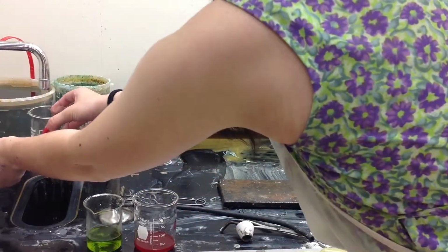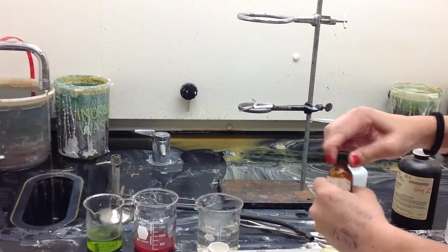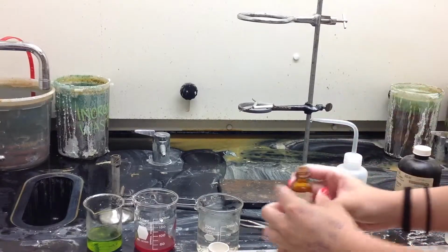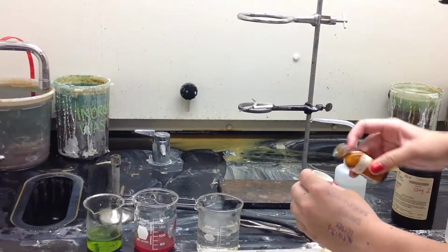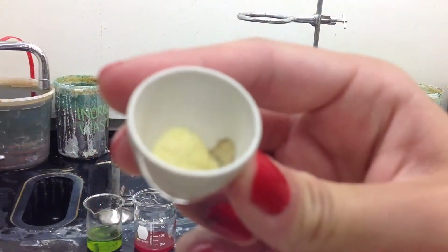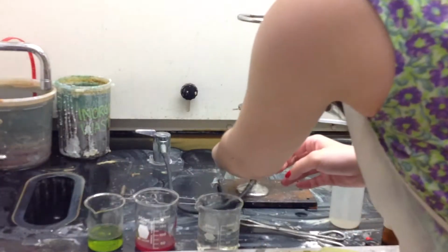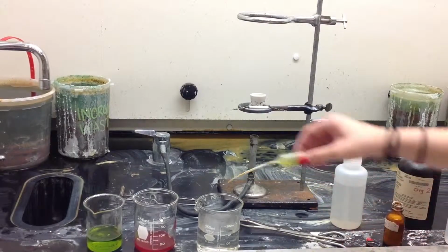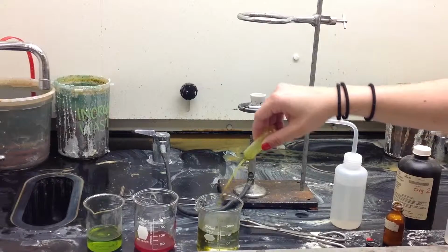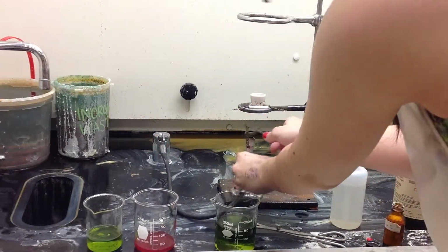Next, we will take the last beaker and fill it with tap water. Then we will set up the stand and crucible for melting the sulfur. This step must be done in the fume hood due to dangerous gases being produced. We then pour a small amount of sulfur into the crucible. The Bunsen burner goes underneath the crucible containing a small amount of sulfur. Make sure the gas is on and light the Bunsen burner.